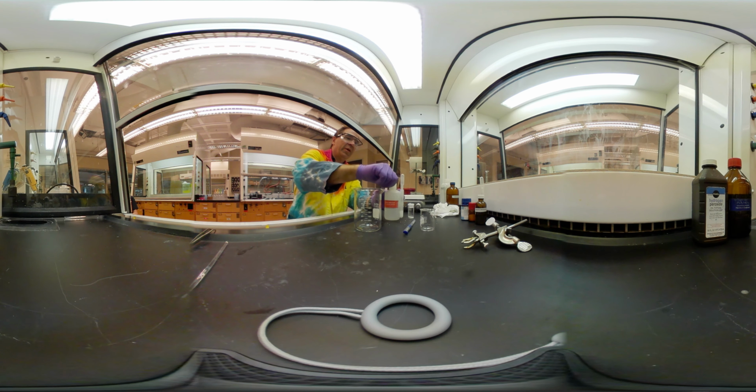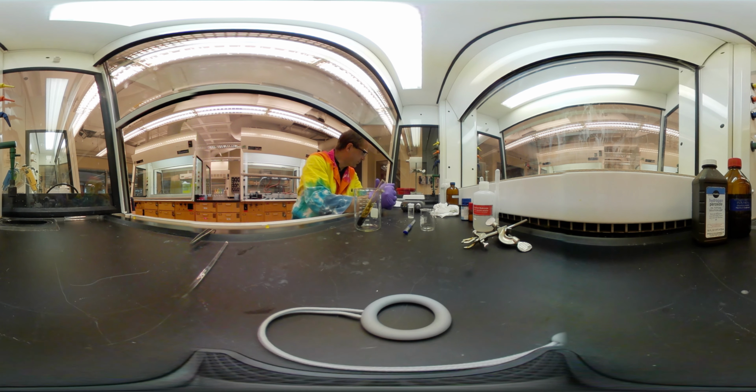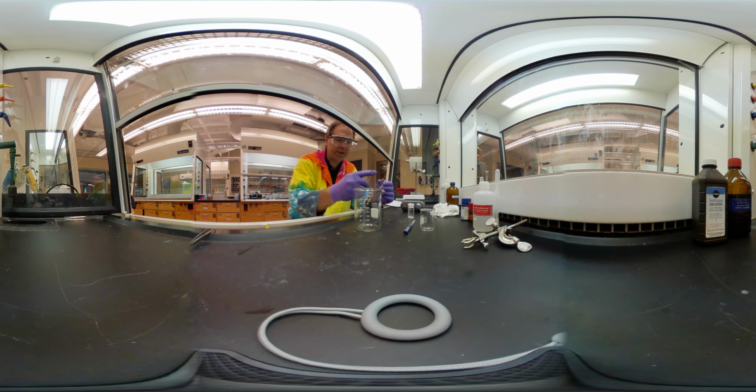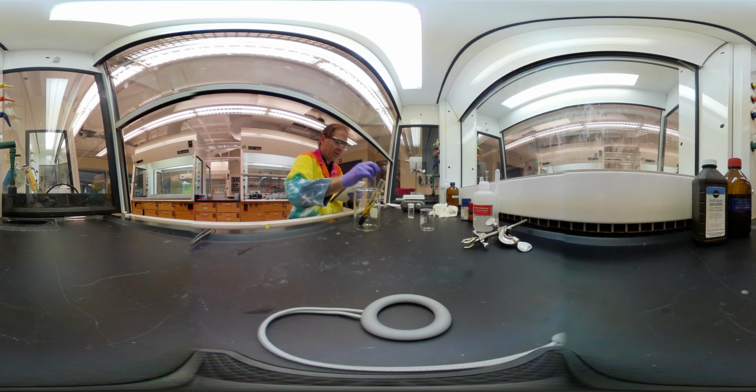What we got? Okay. Now, we added our sodium hydroxide, and it looks like most things have dissolved. And we've got a nice dark red color here, the reddish brown color there. Interesting. Okay. Now we're going to stir this, and you don't ever want to use your thermometer as a stirring rod. It's tempting, but it also causes lots of problems because the thermometers break easily. So let's stir some. Keep the paper towel there for that. I think I'm actually going to do a little better with this. Okay. And so we need to note any color changes. As always, record that in your notebook.